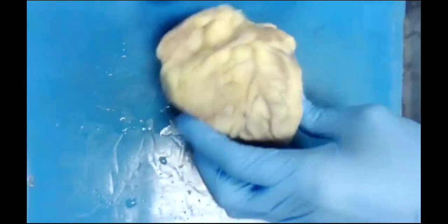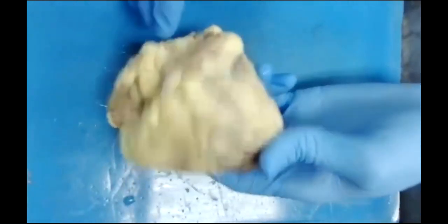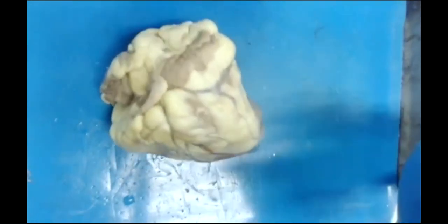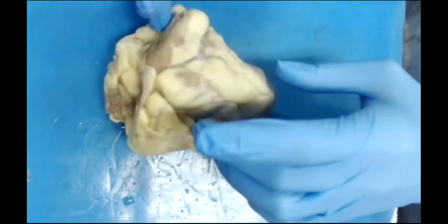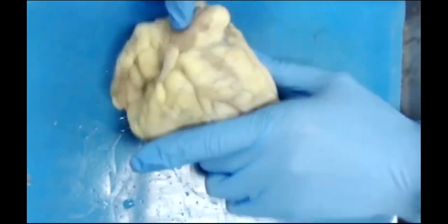All right. So here we have a pig heart. Okay, so this is a heart from a pig. Now, if you're wondering if this is actually a good facsimile for a human heart, it's a good question. However, it absolutely is.